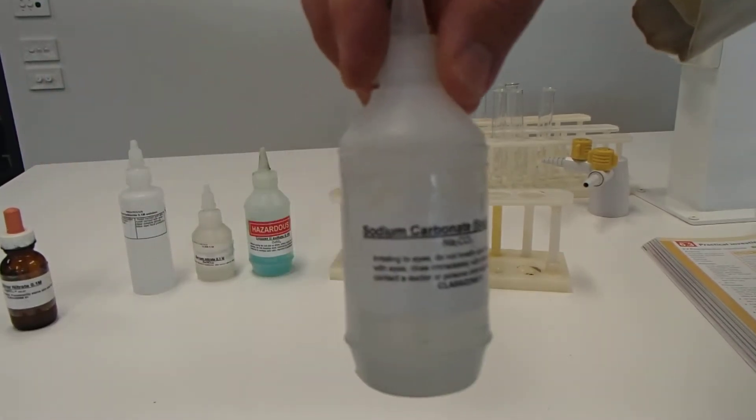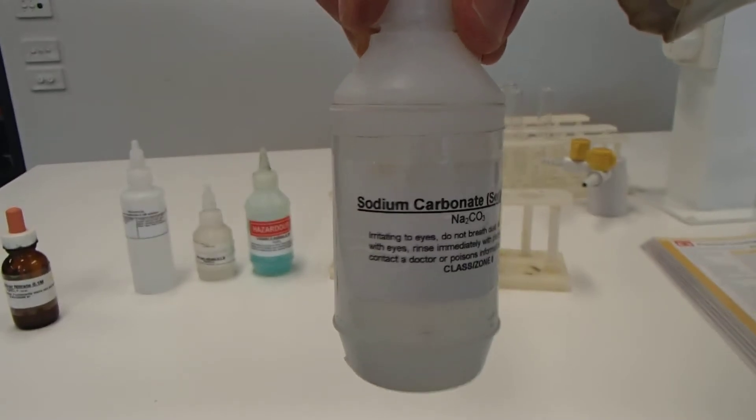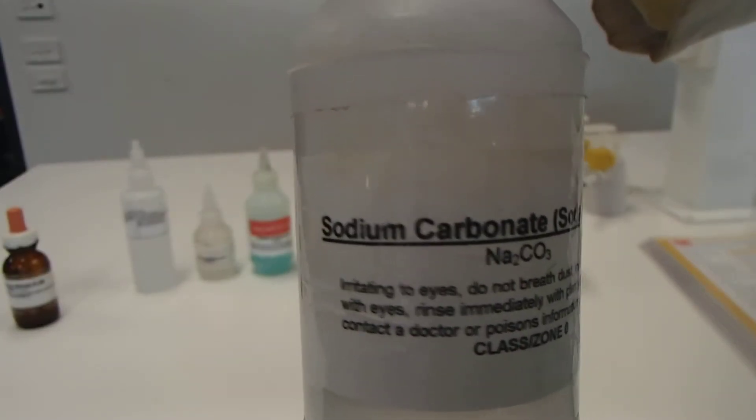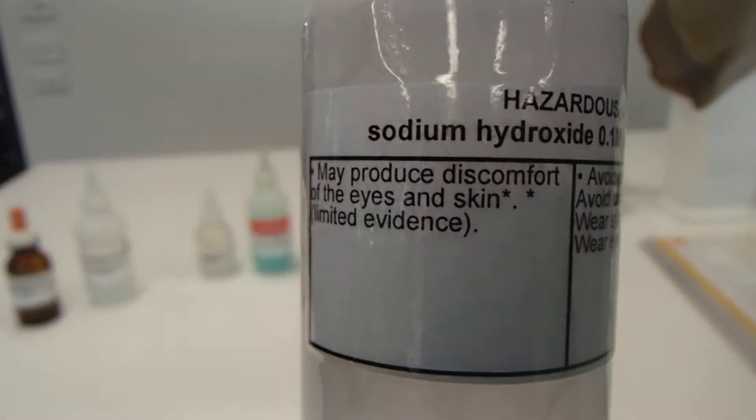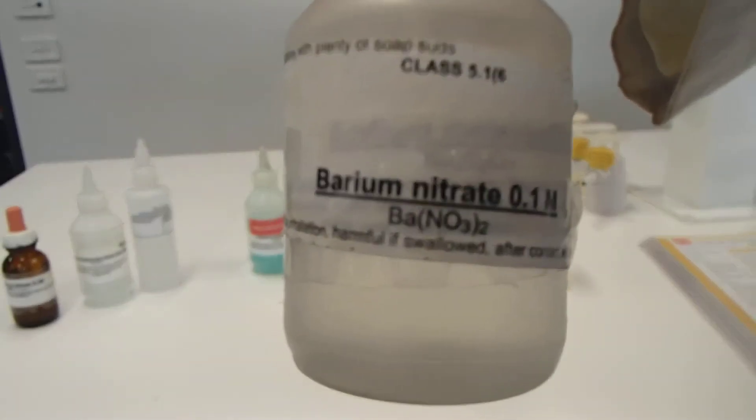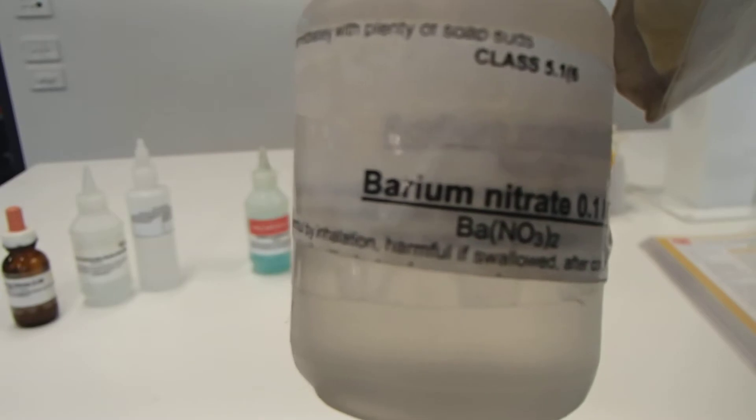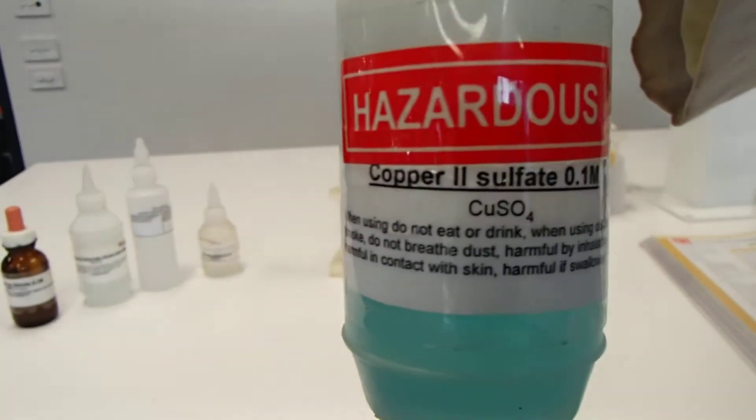We also have sodium carbonate. Sodium carbonate there. Bring that a bit closer so you can see. We have sodium hydroxide. We have barium nitrate. And we also have copper sulfate, copper 2 sulfate. And you can see that all of these solutions are clear. So even though this is blue, it is totally transparent and you can see through it for the copper sulfate.